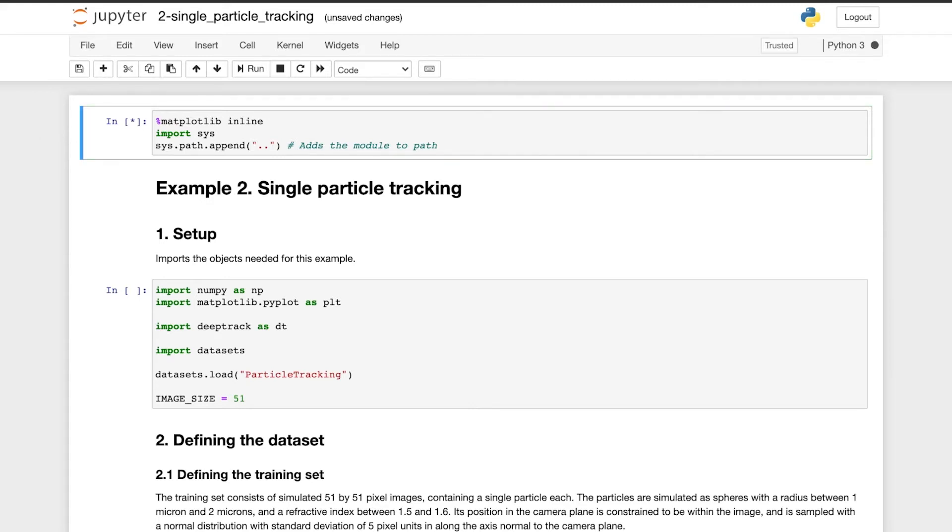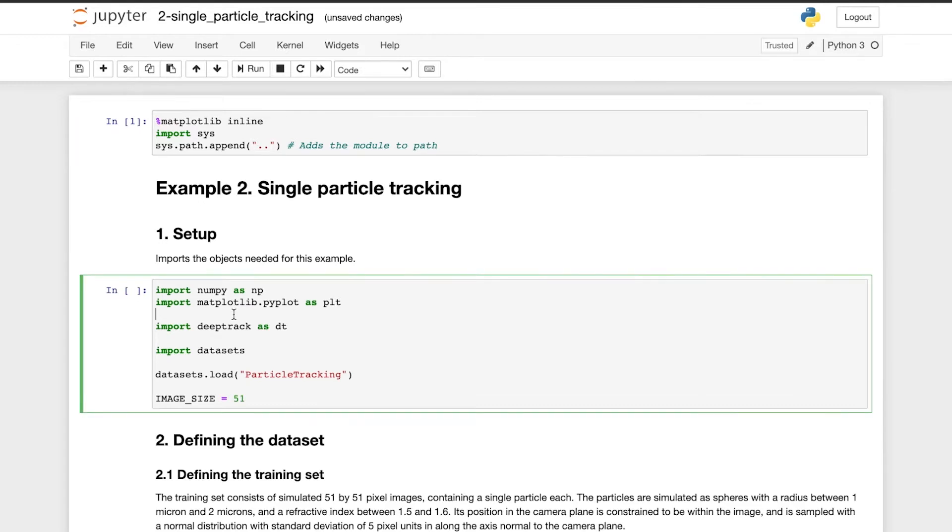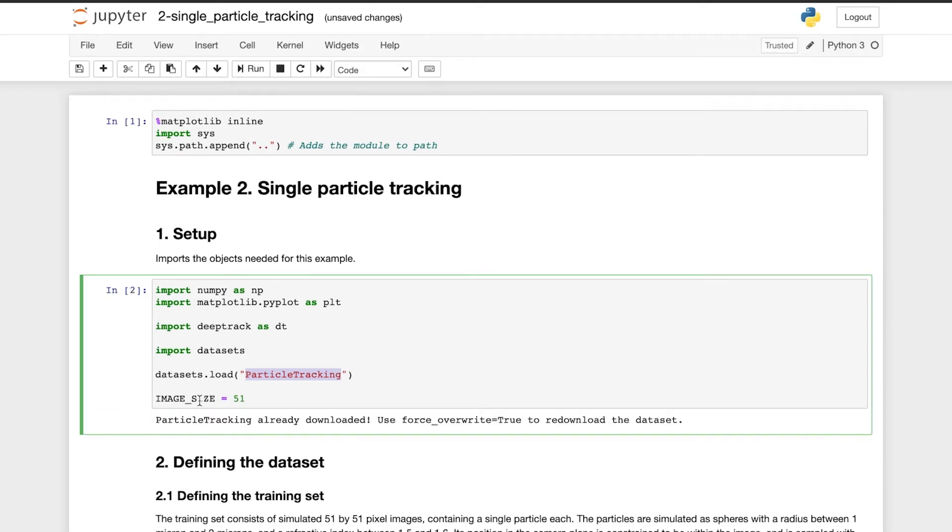First, we import the objects needed for this example and we load the experimental videos we will analyze later with DeepTrack. Here, we also specify the size of the images the network will be trained for.